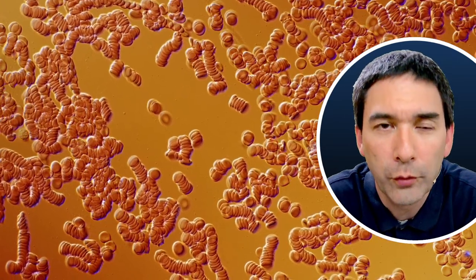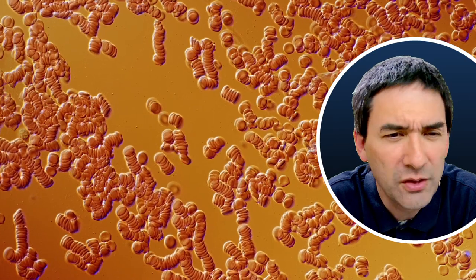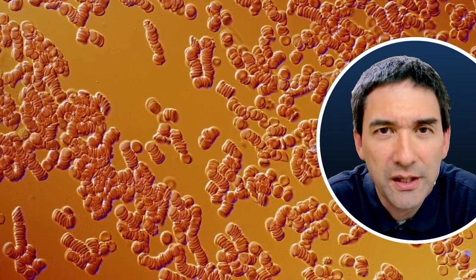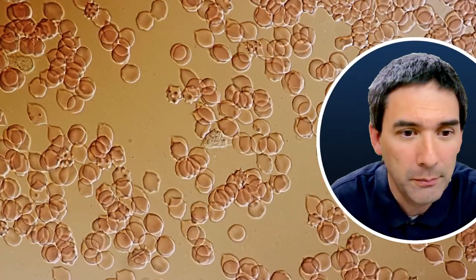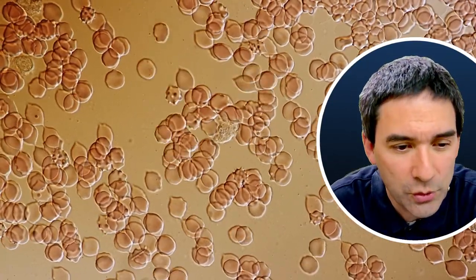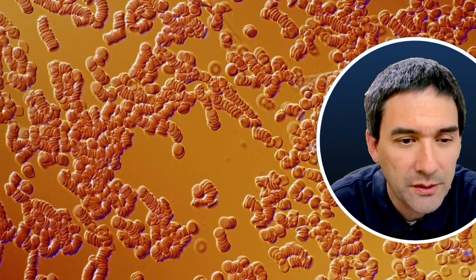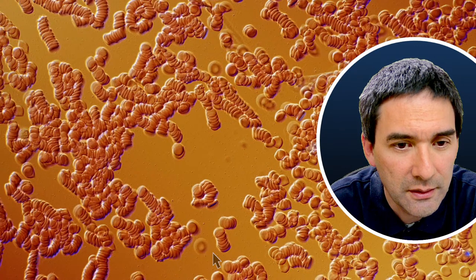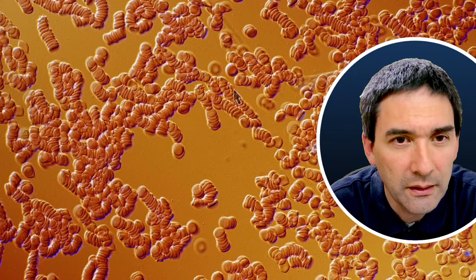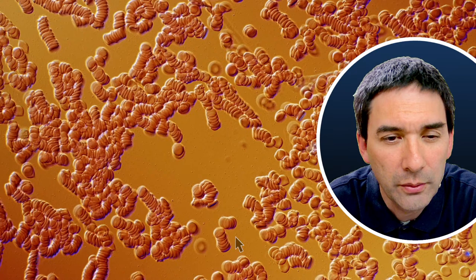It's called Rouleau formation. Rouleau. And why are they doing that? Some people who see that start to freak out. That's not a time lapse. Also my blood. I just want to show you. Let's go back a little bit in the video here. And so you see that they are stacking up, in little rolls of coins almost. Why are they doing that?